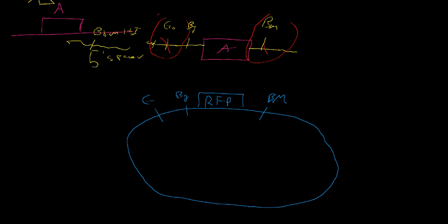We've actually been using a slightly larger part called violacein, which I think is a 7 kb part. And that just shows color much quicker, and it makes the plasmid the dropout, the vector backbone the dropout, instead of vice versa, so it's just easier to purify. Anyways, tangent. So we have our plasmid.